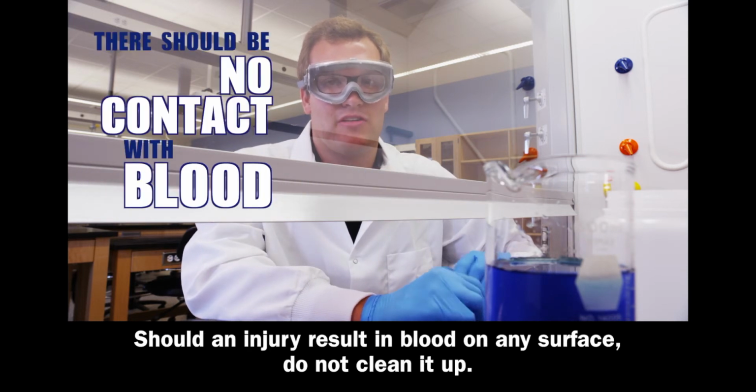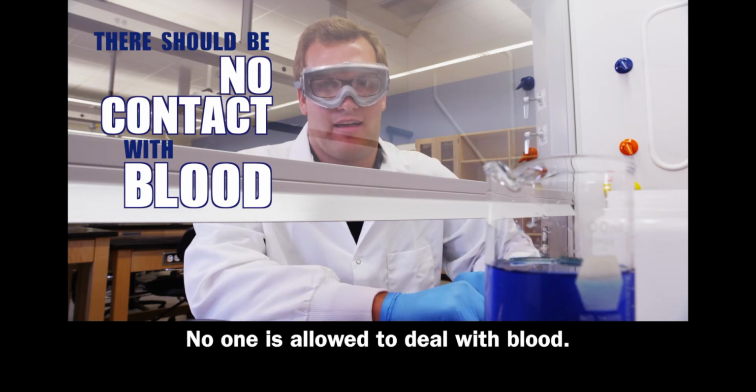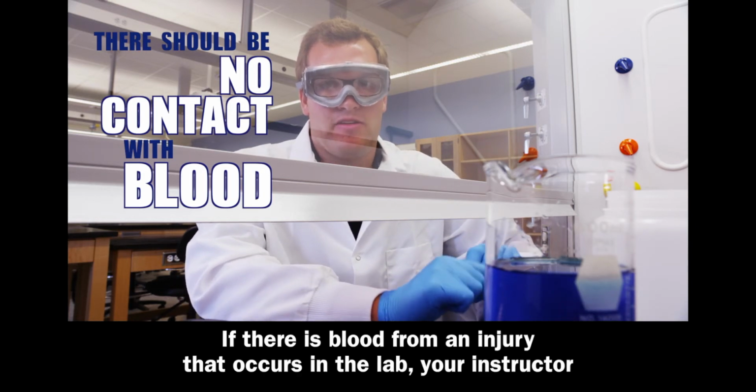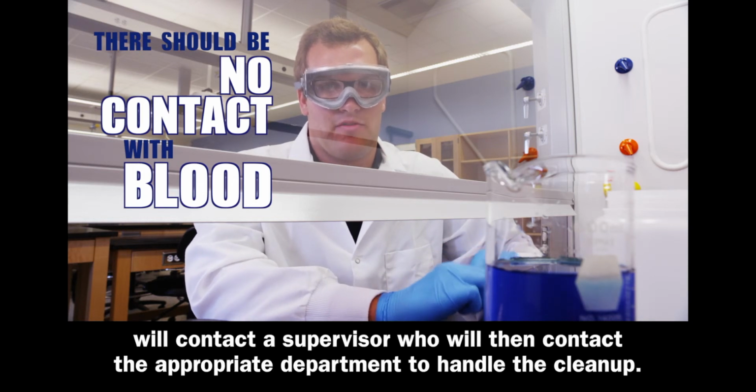Should an injury result in blood on any surface, do not clean it up. No one is allowed to deal with blood. If there is blood from an injury that occurs in the lab, your instructor will contact a supervisor who will then contact the appropriate department to handle the cleanup.